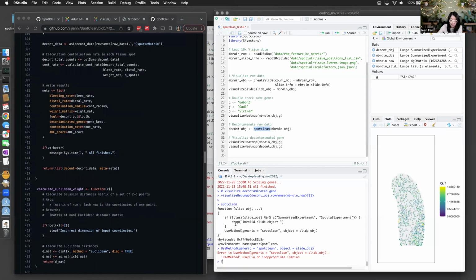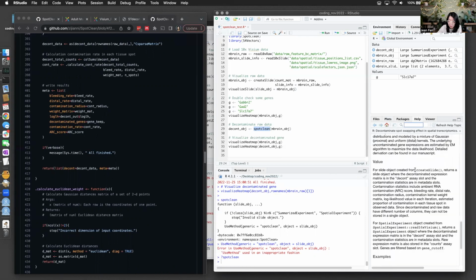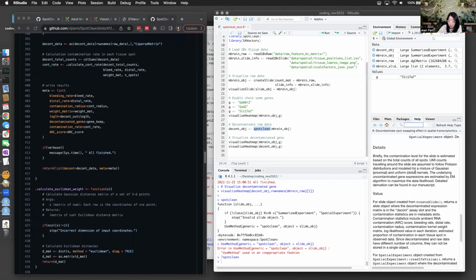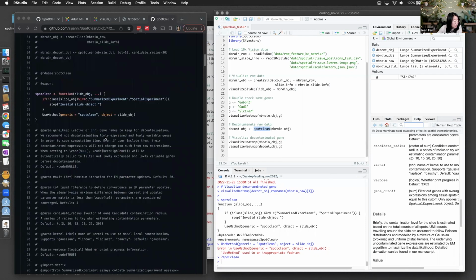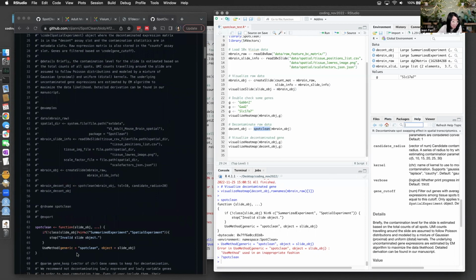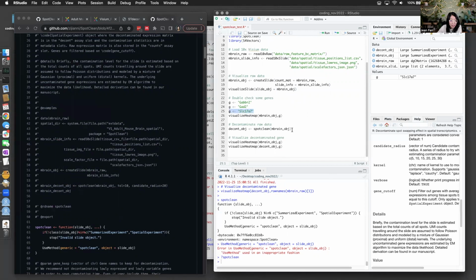I wonder, how does the documentation work? I'm not very familiar with these particular ways of writing functions, calling other generics. Okay, but anyways, fine. Let's go back to, I guess in this analysis code stream, we're not really trying to understand what the method is doing. We're just trying to use it and explore some of the computational components and see whether it's worth taking in to understand further, maybe for a journal club.